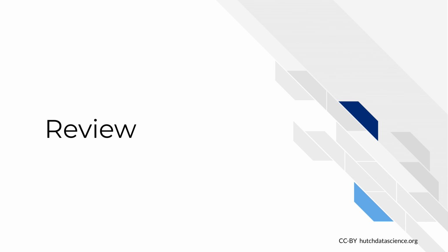In this lesson, we will discuss the motivation of chromatin immunoprecipitation sequencing, known as ChIP-seq, which is an experimental technique used to study protein interactions made across the genome. This methodology has become a powerful tool in how we study the epigenome. Before exploring the motivation and steps to ChIP-seq, we will discuss the critical role the epigenome plays in gene expression.